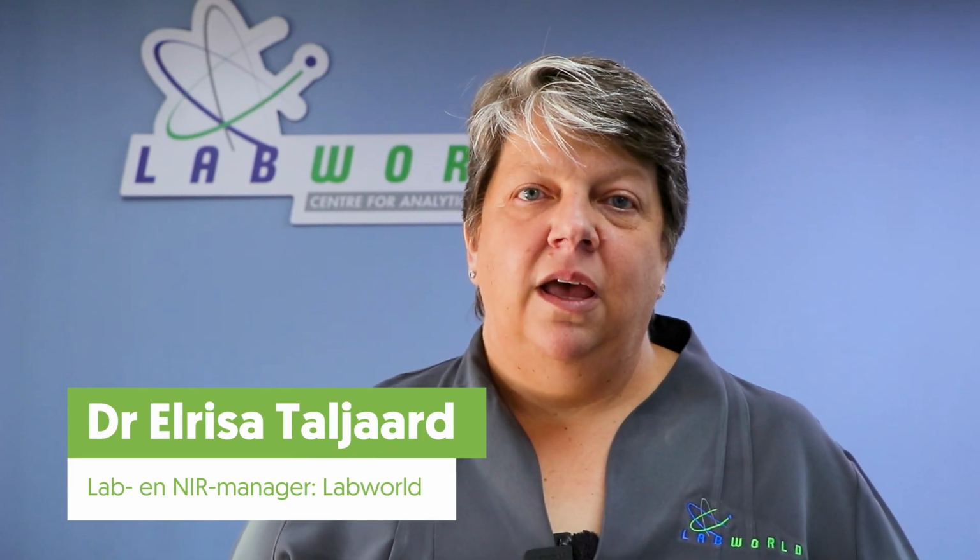In our previous discussions, we talked about how to select a laboratory, what to ask from your laboratory, and what type of questions the laboratory would ask you when you have a sample to be analyzed. In this section, we are going to actually introduce you to Labworld.